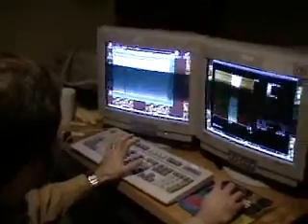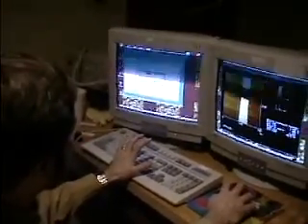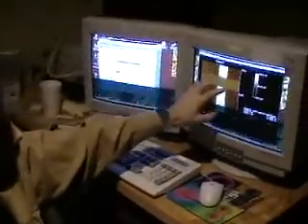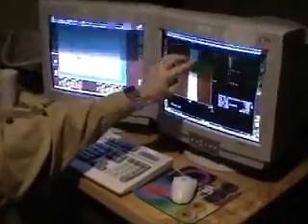And now if I flatten this by clicking on the rolling pin icon and then clicking execute, we get this variation that I was just talking about, where there's a band here that's bright, and that's an artifact because I have high places in my sample here and here that are changing the average height. So let me undo it by clicking on undo.